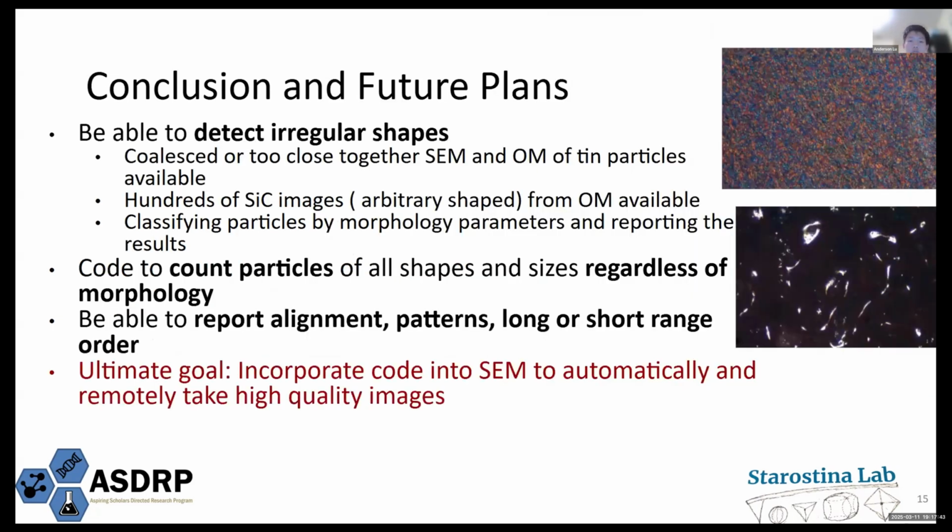As we mentioned earlier, one of our long-term goals was to be able to identify optical microscope images. However, this is a very tricky task, as oftentimes us humans are in conflict on whether or not two particles in an image can be considered as one particle or split into separate particles.